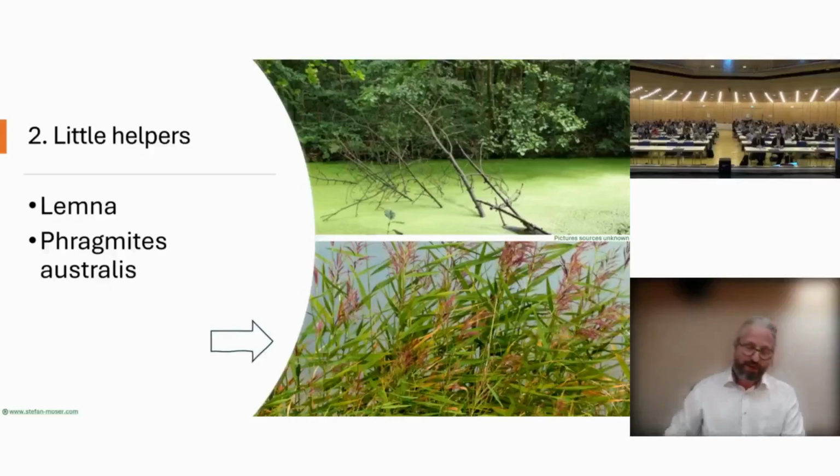For us, the plants are not the only subject to study. They are a rich source of chemical information. Each experiment produces a large dataset that we can explore analytically, statistically, and through data integration. And that's really the heart of our work, using data integration to translate biological signals into quantitative understanding.